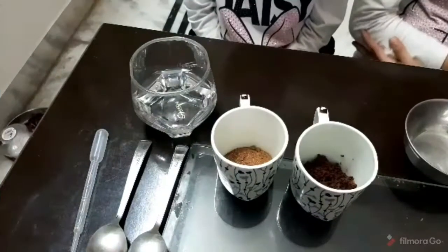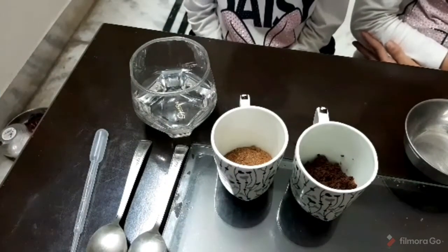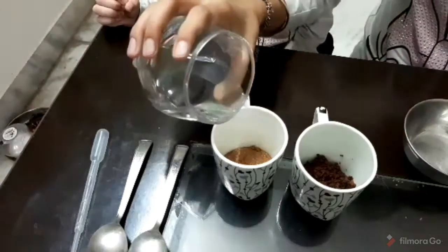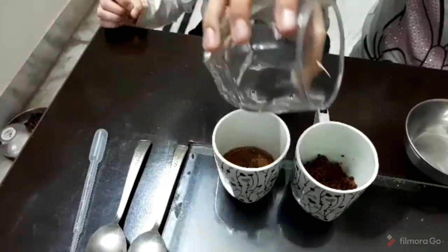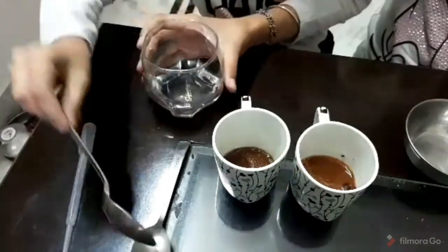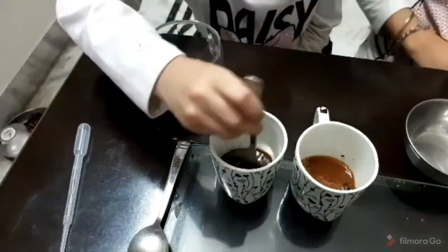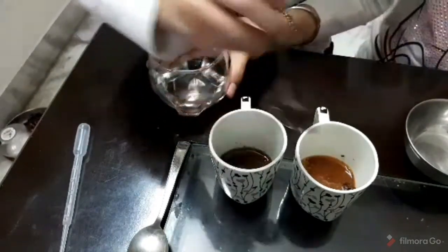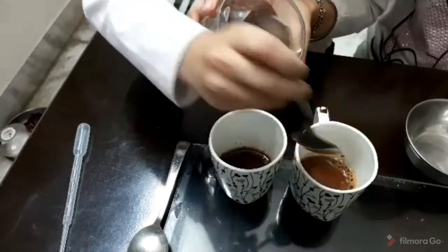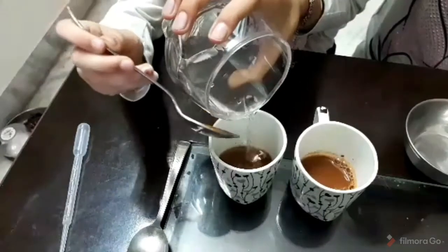So let's start. First, we will prepare soil suspension using filtered water. Let's settle for 1-2 minutes.